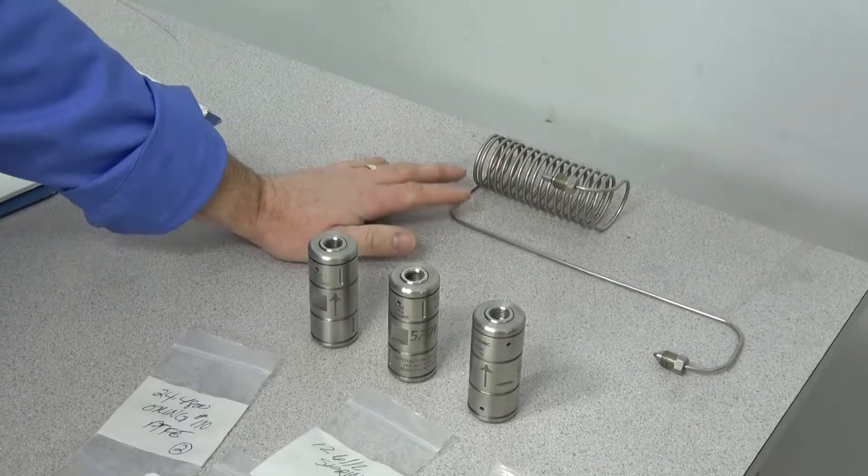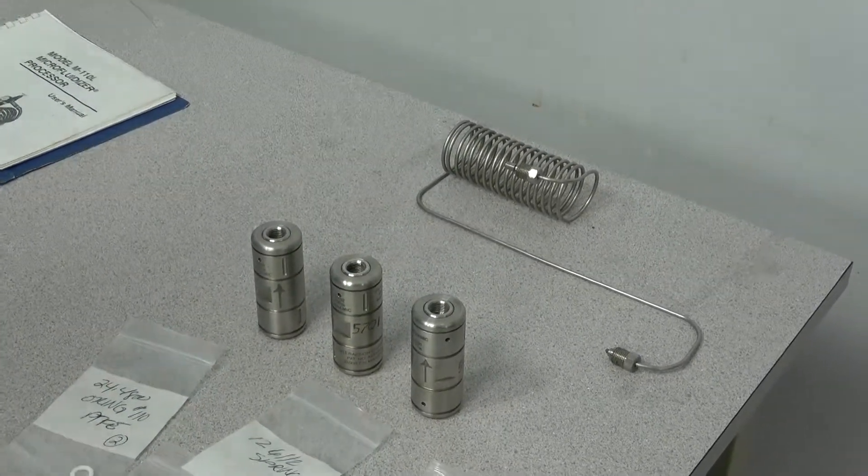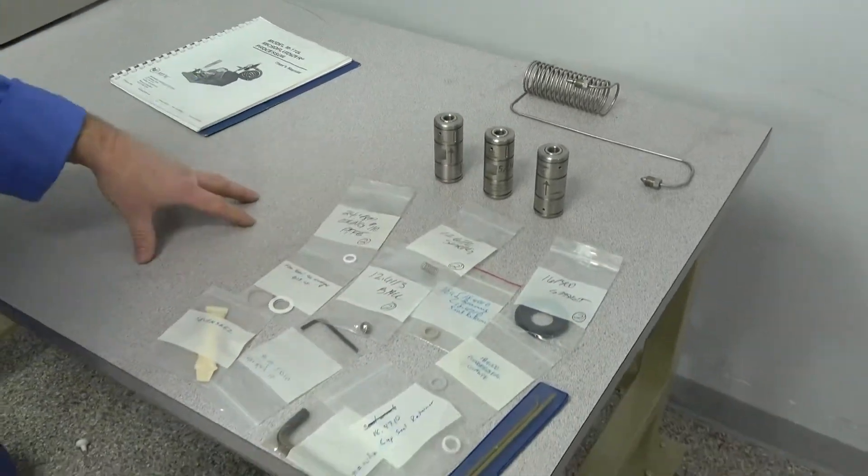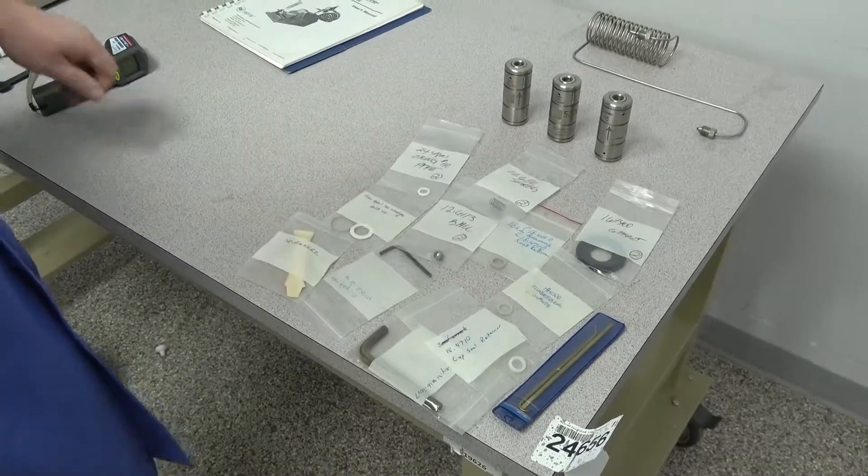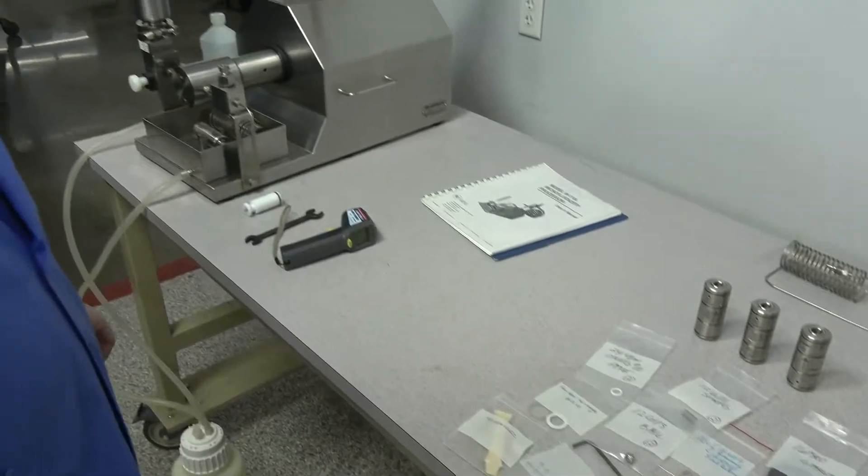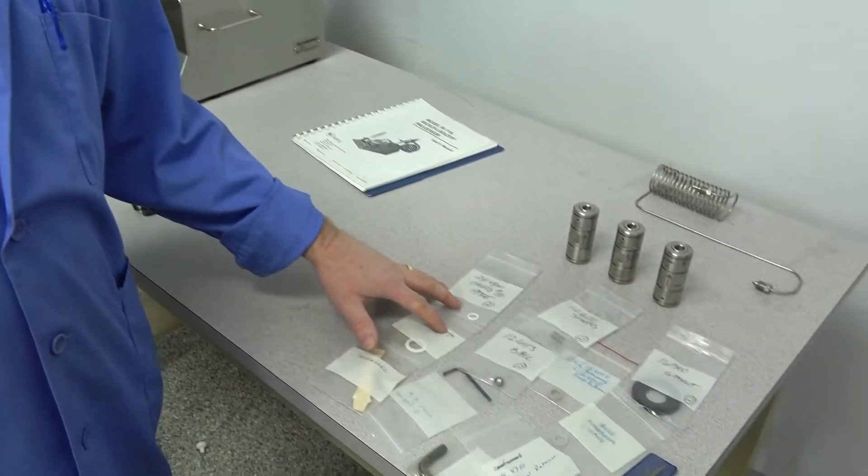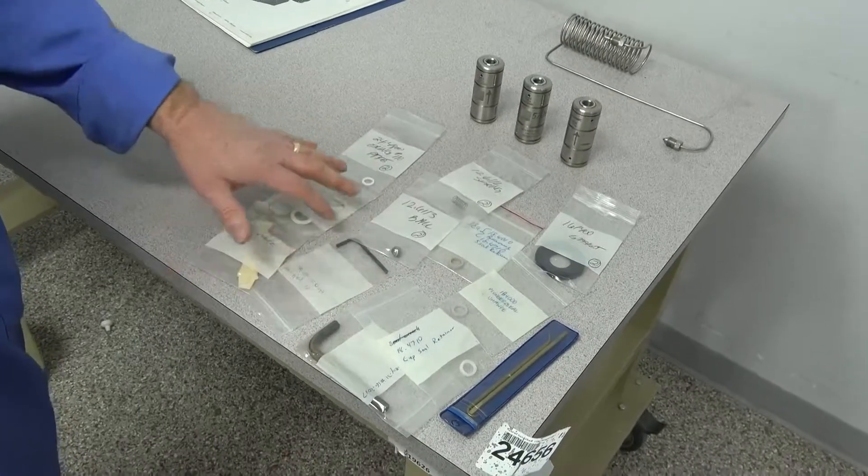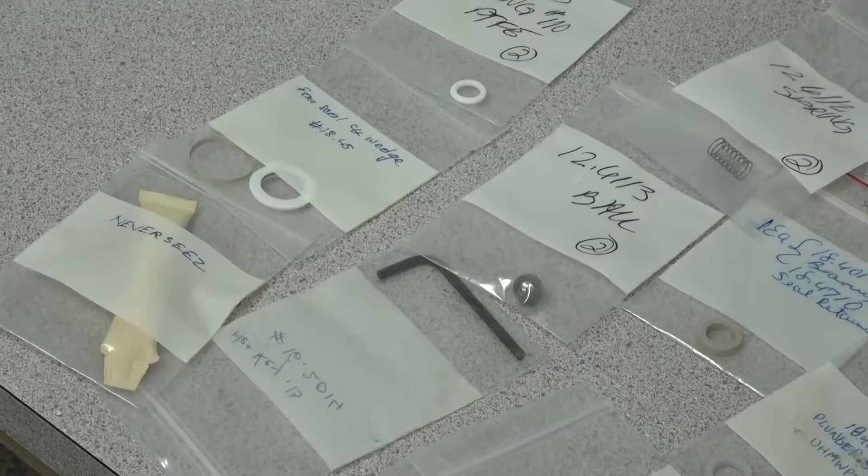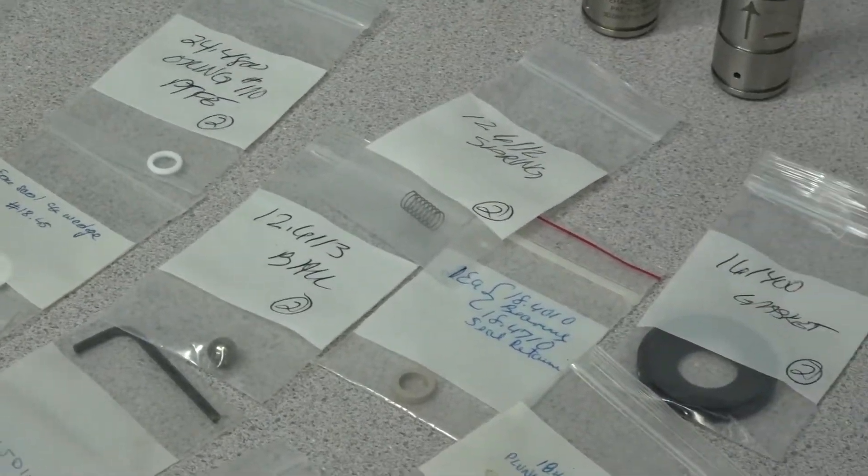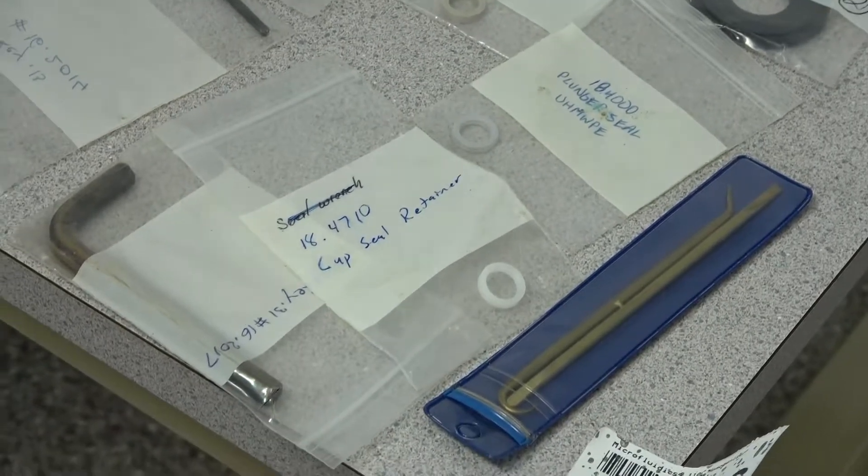Another thing is we have an extra cooling coil, which if somebody has a system or you want to have a backup one for some reason, we're also selling this separately. And then last, we have a really nice gasket kit here that has pretty much a whole rebuild that would rebuild one of these systems. I would have normally probably rebuilt it, but everything worked so good that I hated to replace something that really didn't need it. But if you did want an extra kit to go through later and rebuild it, this is pretty much all the components, including the ball valve here, stainless steel ball valve, and then the seats and O-rings and everything, even back into here where you have your seals and your plunger, and then your valve assembly here, it would get pretty much everything you need to rebuild all the major components in there.